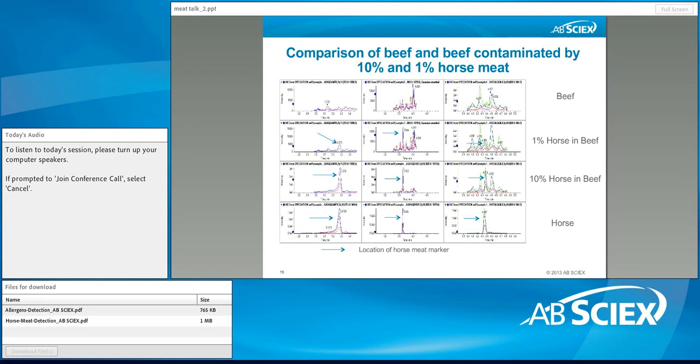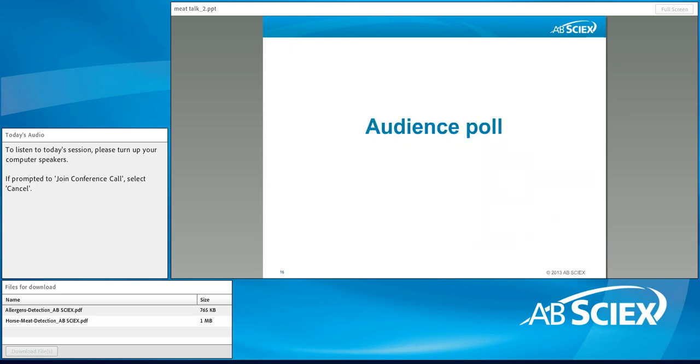So I then decided to see if I could combine the method by adding phenylbutazone transitions to the LCMS method. So this is what I did.